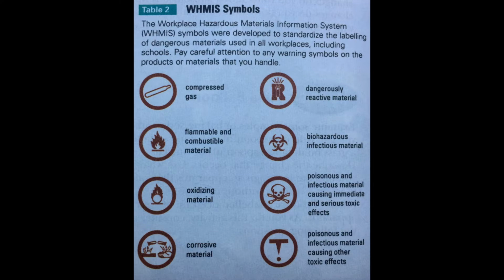So we have compressed gas, flammable and combustible material, oxidizing material, corrosive material, dangerously reactive material, biohazardous infectious material, poisonous and infectious material causing immediate and serious toxic effects, poisonous and infectious material causing other toxic effects.